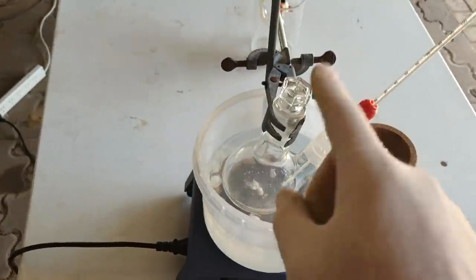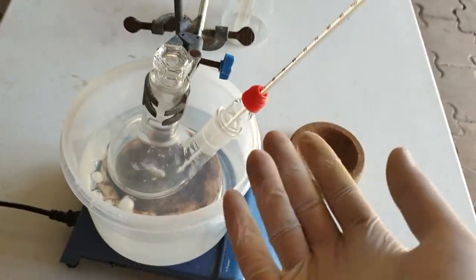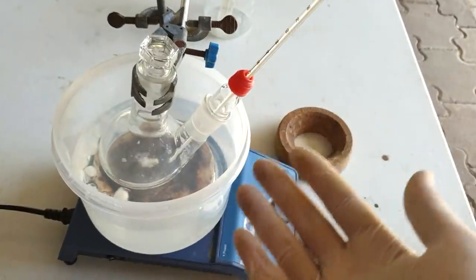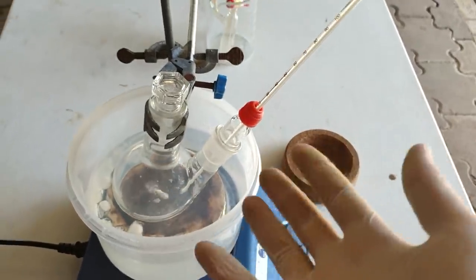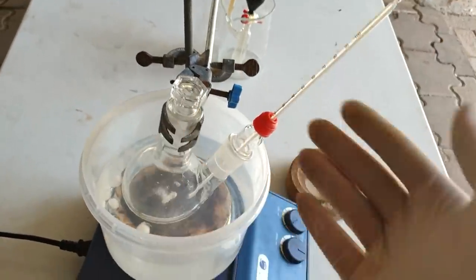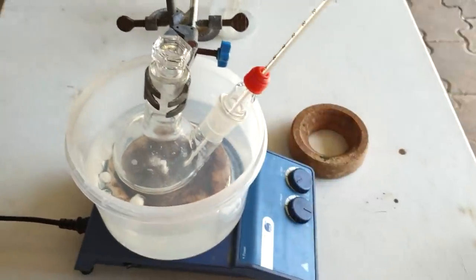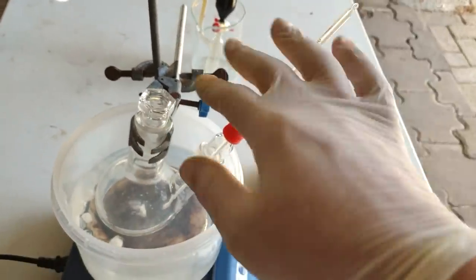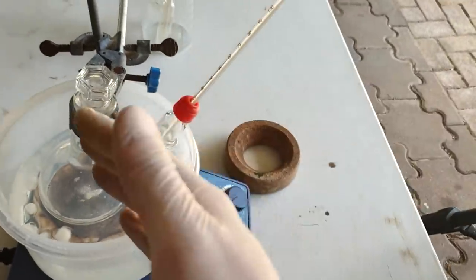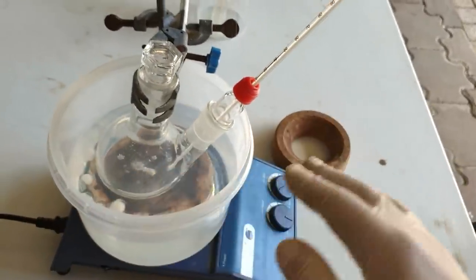Oh, also, yes, the authors ran this under nitrogen atmosphere. It might just be to keep out water, but it might also be to prevent oxygen getting in, which is a much bigger deal. I'm not running it under a bloody nitrogen atmosphere. Hopefully everything doesn't blow up, because it might generate a lot of gas, and I'm keeping it sealed, so I'm trying to make that balancing act between protecting it but also not letting it blow up. So there's a line there I'm trying to walk.